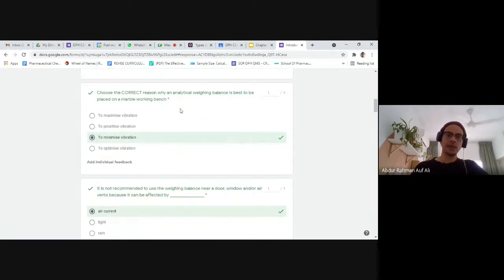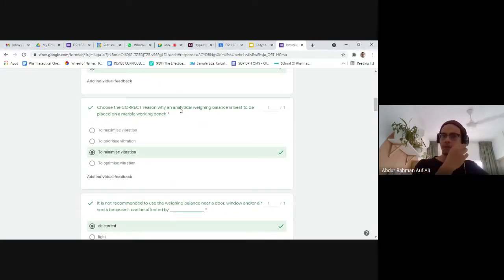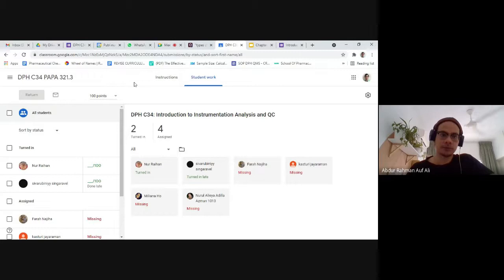Question number 3, if you have any questions, just turn on your mic. Kalau kamu tulis dalam chat room, saya macam tak perasan ke, saya tak dengar ke bunyi notification tu. So if you have any questions, just turn on the mic and tanya soalan. Question number 3, choose the correct reason why an analytical weighing balance is best to be placed on a marble working bench. So this is based on the video yang ada dalam Google Classroom.